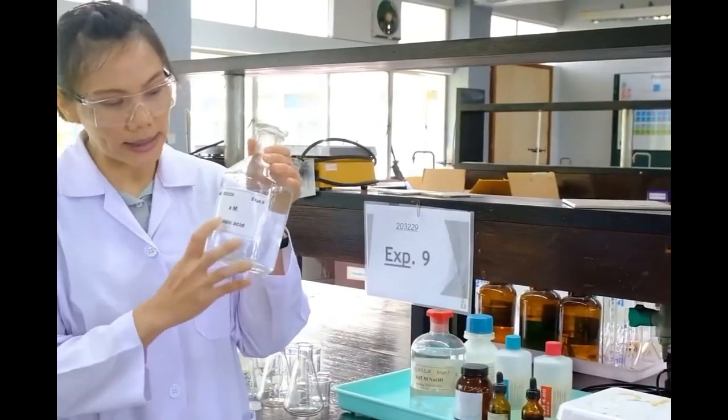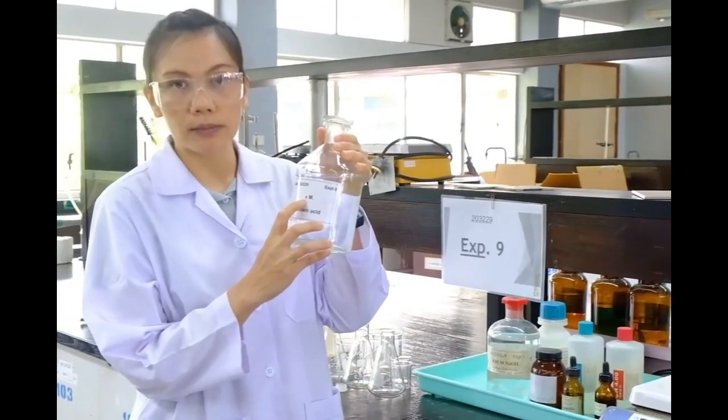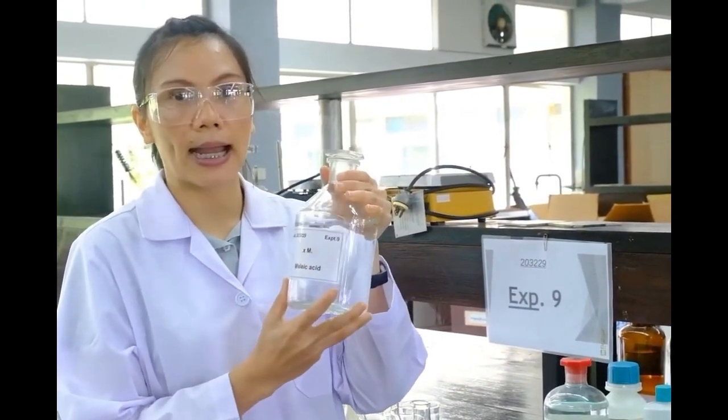You'll see that the lab provides X molar solutions. You need to find the value of X, and then we'll determine the Ka of maleic acid.